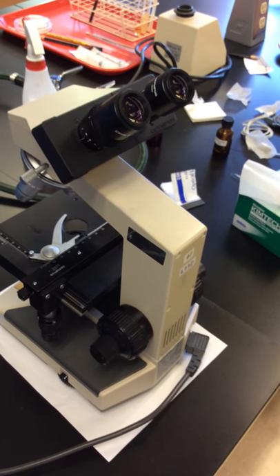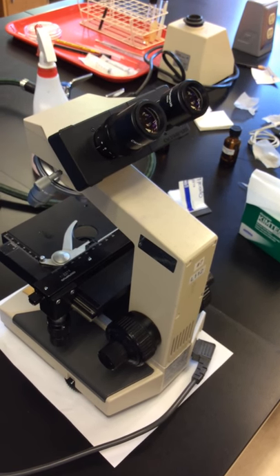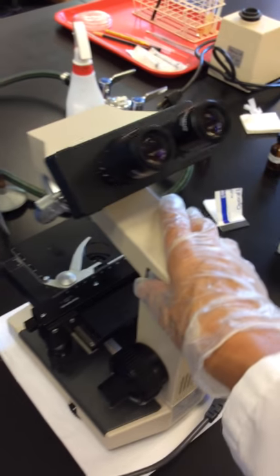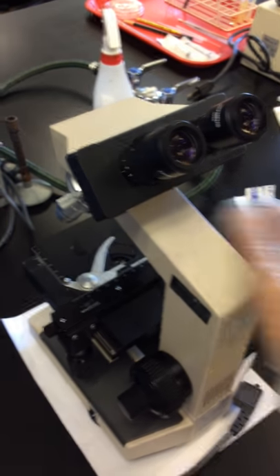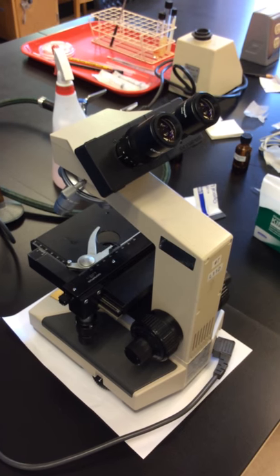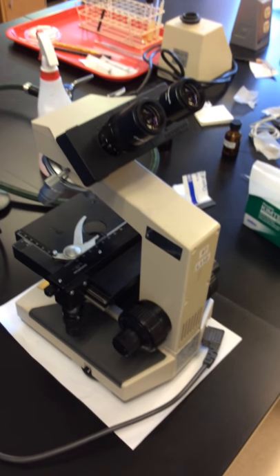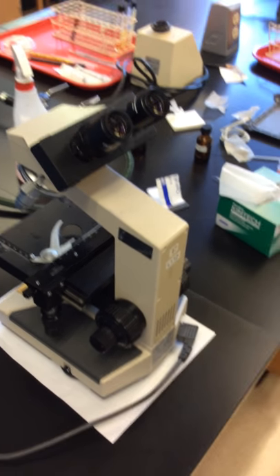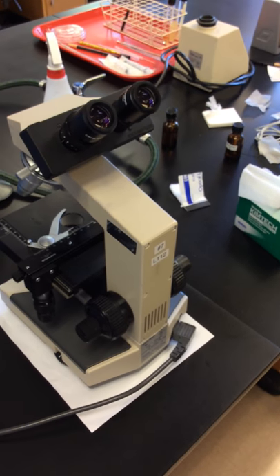Returning the microscope to the cabinet, you always want to use a two-hand carry. You're going to grasp the arm with one hand and support the base by placing your other hand beneath the base. You want to hold it close to your body. Because sometimes the lab is crowded, it actually helps to hold your elbows inward. It makes it less likely that you're going to bump into somebody.